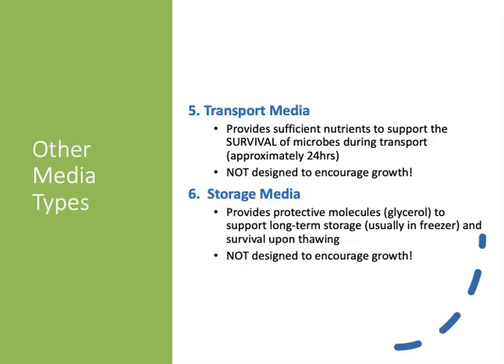So, we have two kinds of growth media, basal media and enriched media. We have two kinds of special media, selective and differential. There are two other large categories of media. One is called transport media, and one is called storage media.